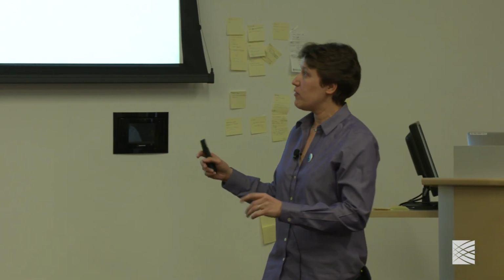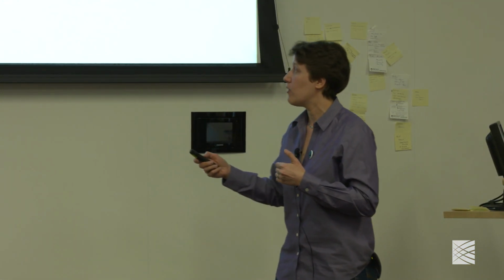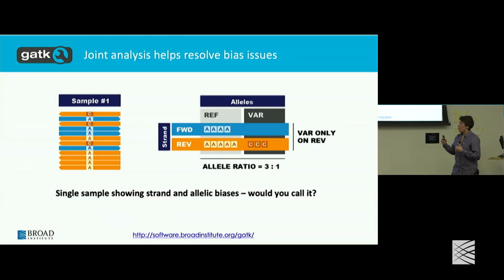Okay, but let's stay focused on this particular aspect of joint calling, the very technical advantage of seeing the data, seeing the evidence for or against a variation. One of the things that we want to be able to evaluate while we're doing the calling, and later in the filtering, so this is foreshadowing the next step of variant filtering a little bit, is whether, in the case where it looks like there's evidence for variation, it is actually evidence of variation or whether it is artifactual.